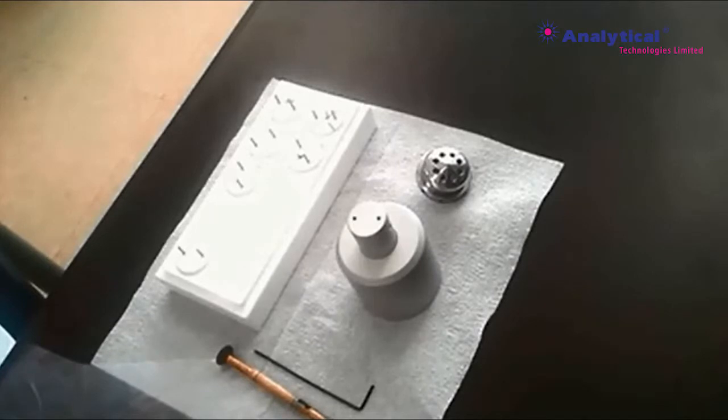Initially, the filament is attached. However, after 40 to 100 hours of use, it will lose its function and the filament will disconnect, requiring a new filament to be inserted. The filament is combined with the wehnelt cylinder before inserting it into the electron gun, and in case of disconnection, vent it, open the gun, and change it.